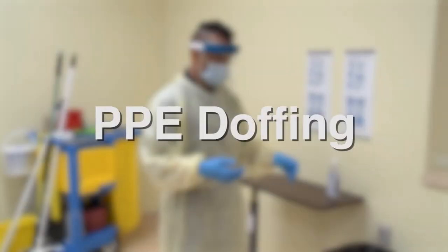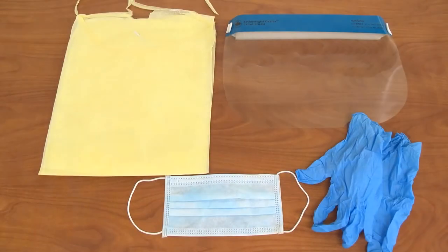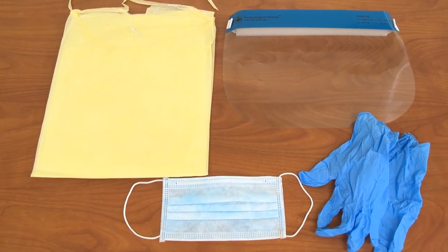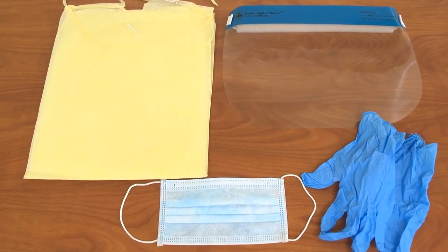Doffing of Personal Protective Equipment. Let's review removing personal protective equipment, or PPE, including disposable gloves, gown, face shield, and mask.